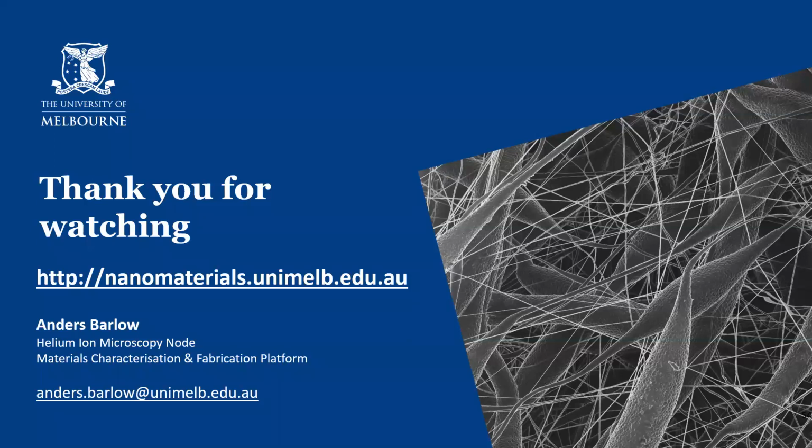Okay, so we've got another question about graphene. With a resolution of 0.3 nanometers, can you see a single sheet of graphene if you are not looking at the edges? So we can see the interaction. I guess the key thing there is we need some amount of contrast. So we can see on single layer graphene, or at least what people have told me is single layer graphene, we can see folds and creases and tears. And that's what tells us we're seeing the graphene layer.